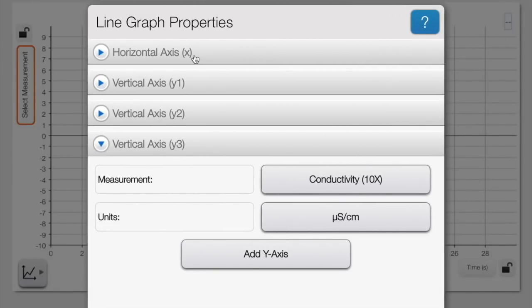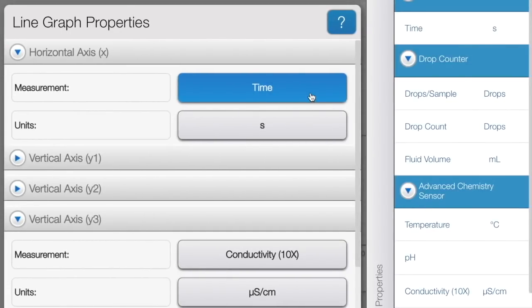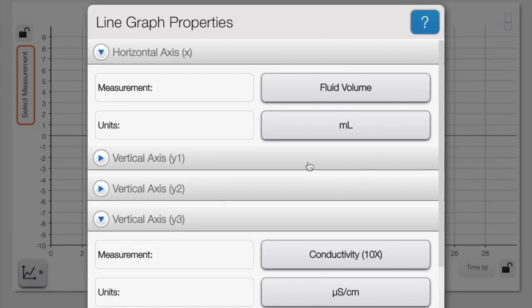Then press add y-axis again and select the conductivity meter 10x from the menu. Finally click the horizontal axis menu found above the vertical axis tab. Click on the button that says time and instead select fluid volume found under the drop counter menu on the right.